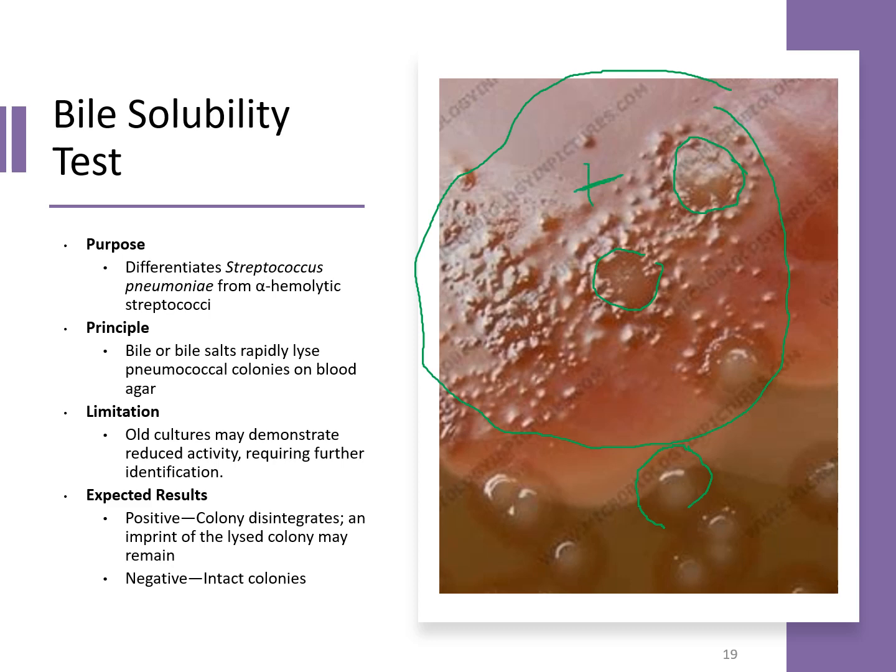And so that would indicate a positive test. And then of course if you were to drop it on the colony and the colony remained, then that's considered negative. And so these two here together side by side, you don't have a negative on the plate. Down here it's just where the reagent has not come in contact with those colonies.